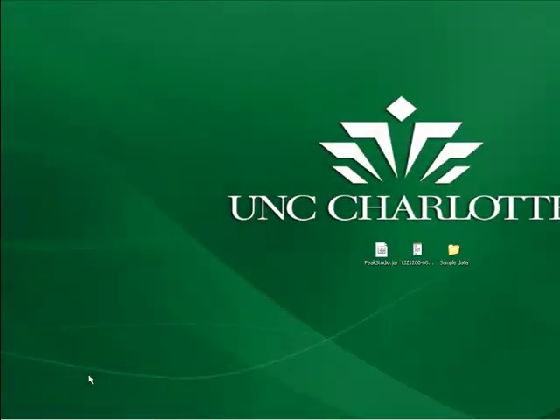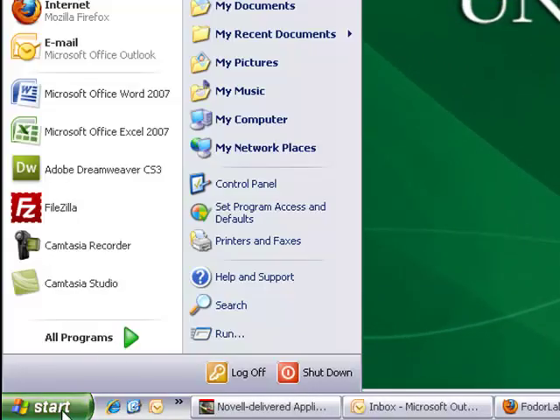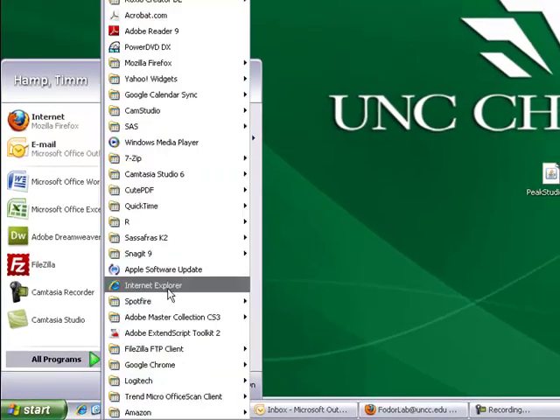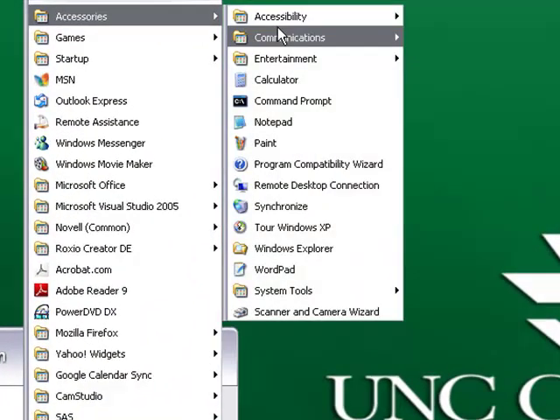It is also possible to open the program using the command prompt. Opening this way allows you to allocate more memory from your system resources than Java automatically assigns, which may be necessary with larger datasets. To access the command prompt, go to the Start button, then select All Programs, then Accessories, and then Command Prompt.